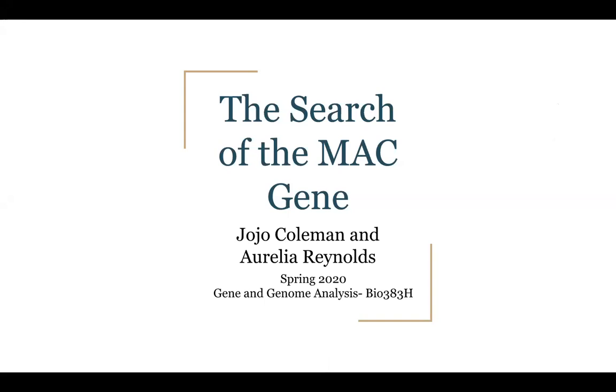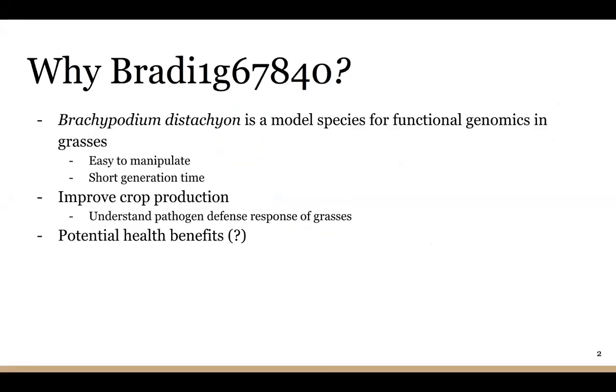We are presenting our semester-long project for gene and genome analysis. Using multiple experimental methodologies, we studied genomic functionality using the model species Brachypodium distachyon. Brachy is an easily grown species with a relatively small genome and a short generation time, but research surrounding gene function is limited.